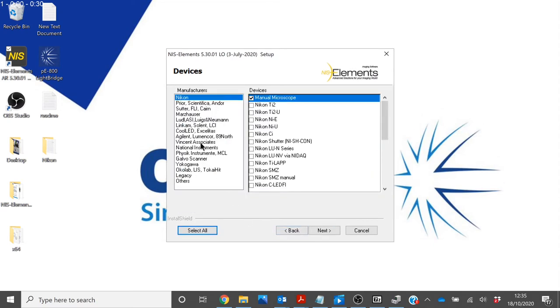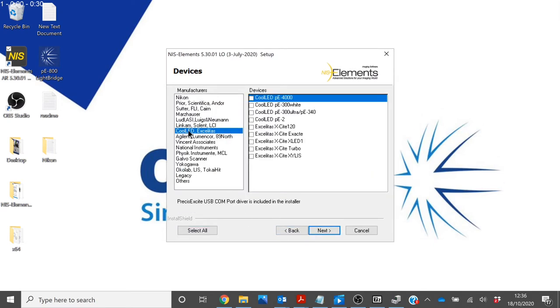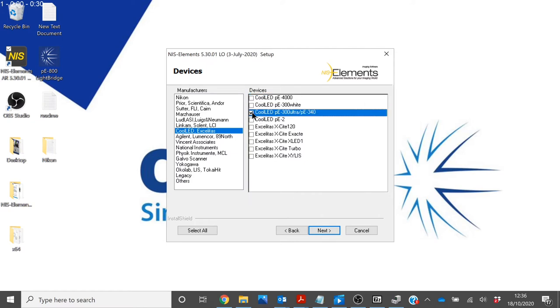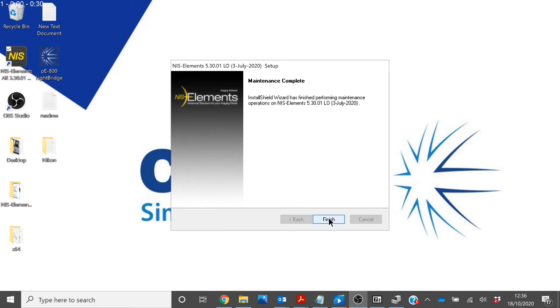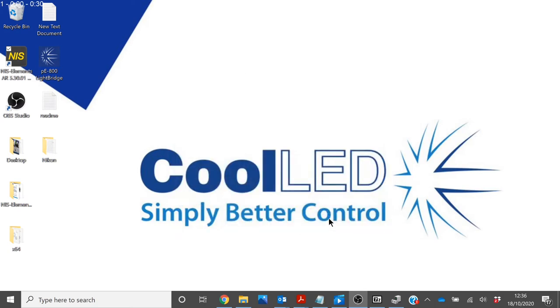When you get to devices, you will need to go down to CoolED and tick the CoolED PE300 Ultra slash PE340 Fuhrer. In later versions of NIS Elements, this will display as the CoolED PE800. Then click Next. Once this is complete, you are now ready to run NIS Elements.